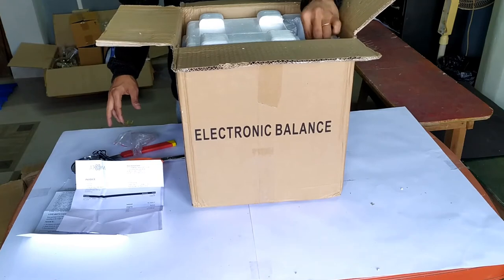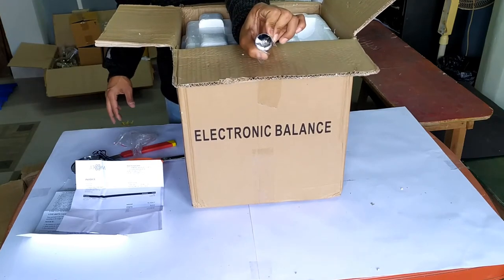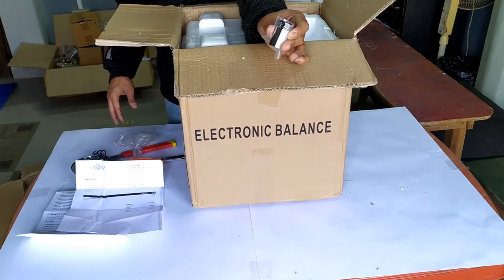I am handling the weight using the plastic ziplock bag and not with bare hands because even fingerprints can distort the actual weight of the metal block.